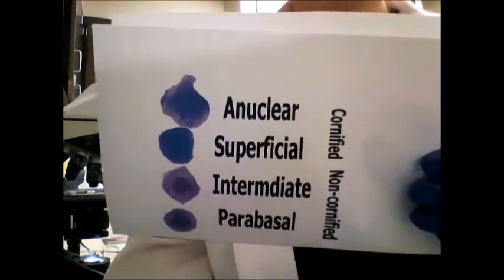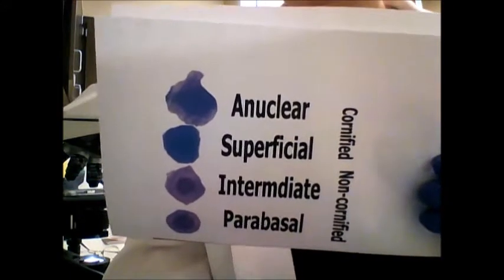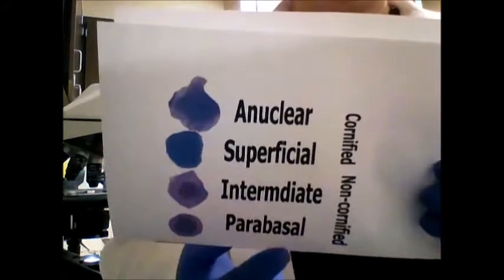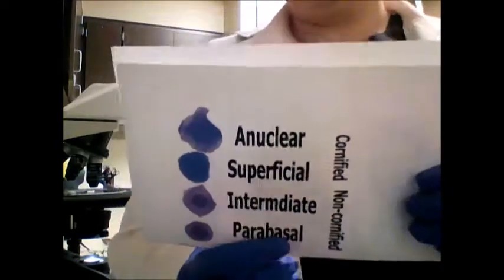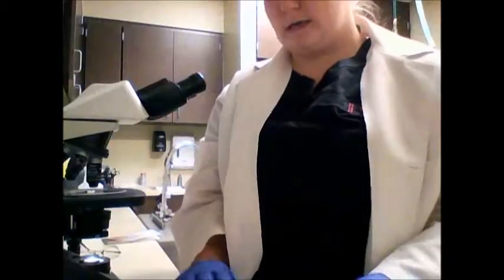I didn't really see many neutrophils, but there was a lot of debris, and that's very characteristic for diestrus. And then in anestrus, you're going to see parabasal cells and intermediate cells, and there's not going to be very much bacteria. There was a lot of bacteria in Wendy's vaginal cytology.